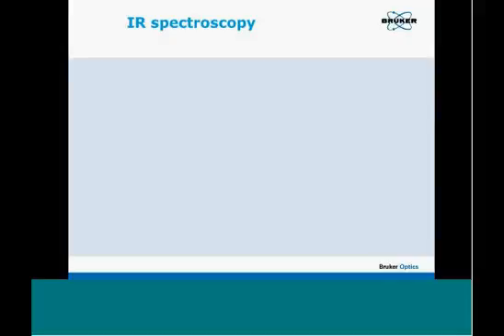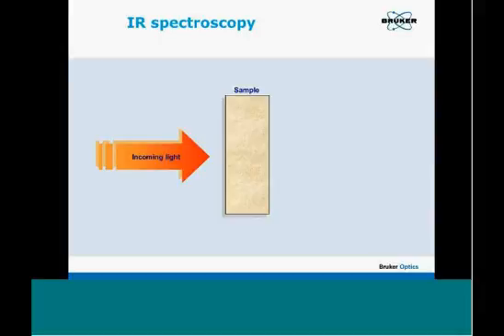Well, when we're doing spectroscopy, we are not working with single molecules. We work with a sample. So how do we do measurements? We have a sample. We shine infrared light. Part of this light will be absorbed by the sample, and what we measure is how much light is transmitted through the sample. So basically, we measure a transmission spectrum, and based on this, we can calculate how much light is absorbed by the sample. So this is how we link vibration and spectroscopy.